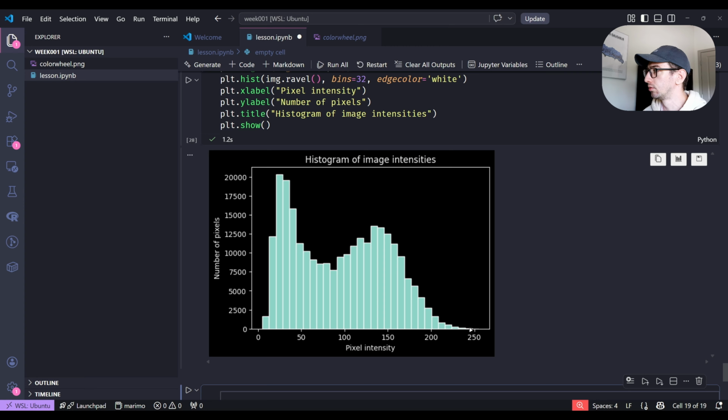I think this image is pretty black and it has so small white values and it has a lot of gray values, black and gray. Yeah, correct. So you're saying that, for example, we don't have a lot of values on the right side of the histogram, right? And mostly they are concentrated somewhat in the left side of it. And there are a lot of dark parts in the image. So maybe some other ideas.